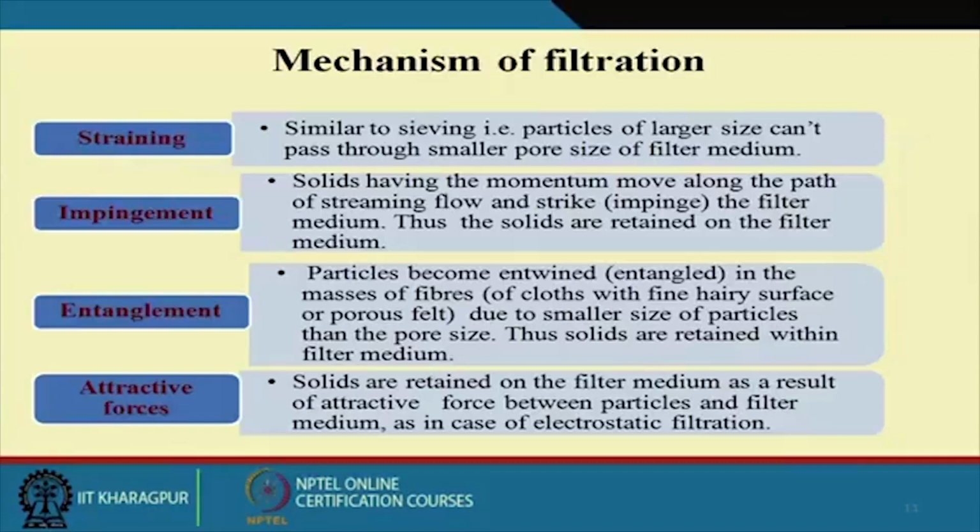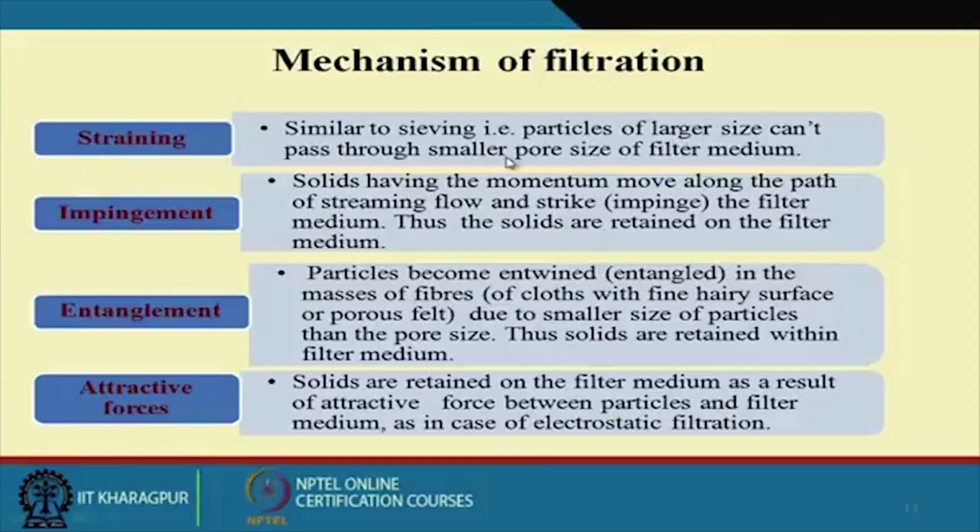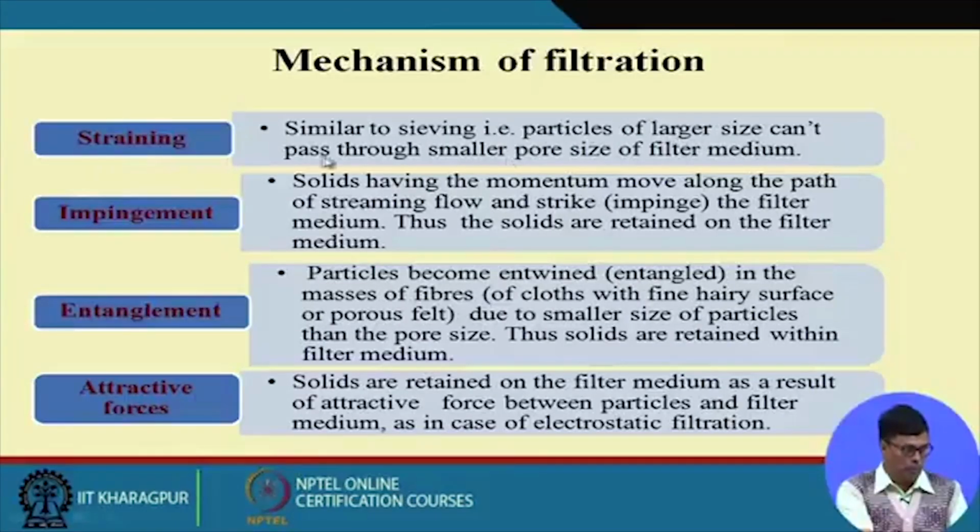Sieving means a kind of perforated disc: particles of larger size cannot pass, smaller size can pass. That is straining. Then impingement is when solids having momentum move along the path of a streaming flow and strike, or impinge on, the filter media, and thus the solids are retained on the filter media.